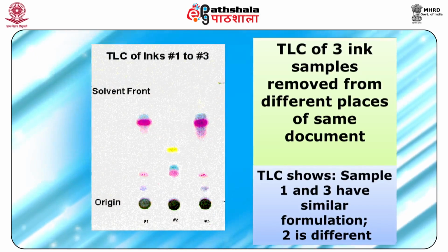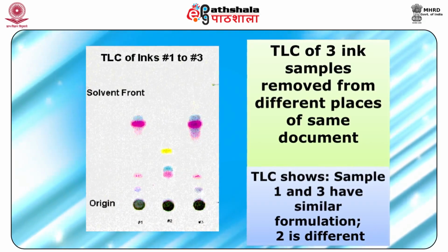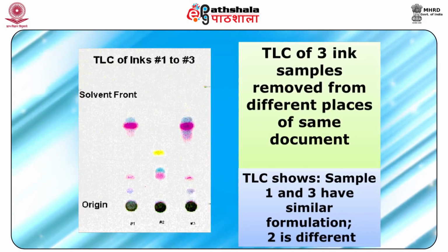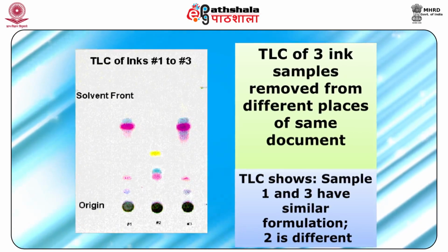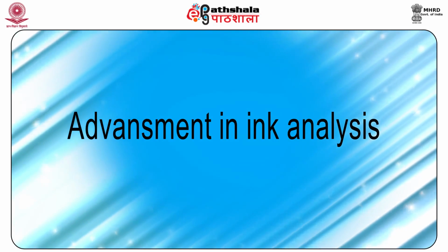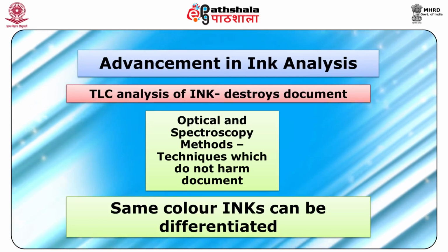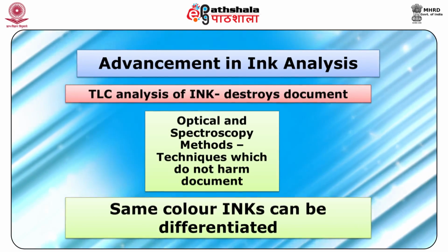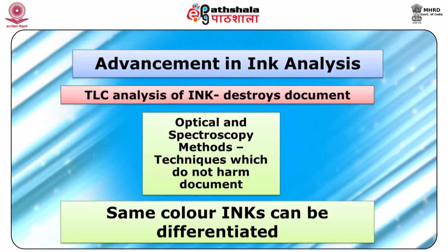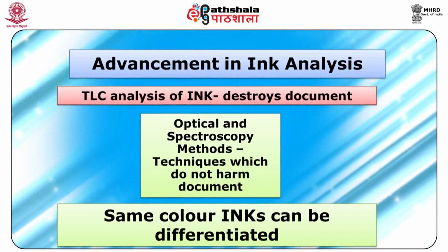Now, here is a picture that represents the band patterns corresponding to ink removed from three different areas of a document. The figure shows that samples 1 and 3 have a similar formulation, while ink 2 contains different components than the other two. Now, let us see the advancement in ink analysis. The most commonly applied are optical and spectrometry methods, finished with destructive examination by means of thin layer chromatography.